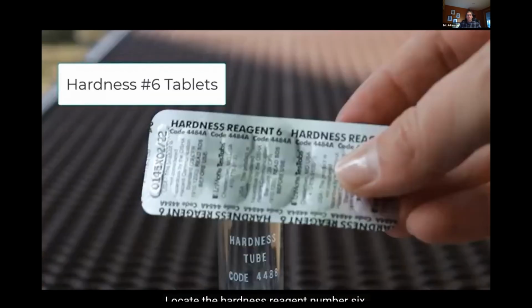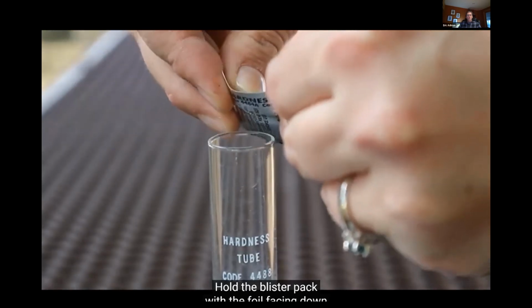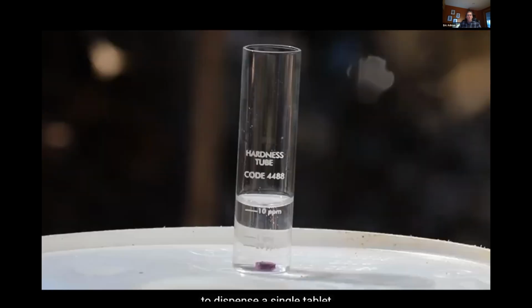Locate the hardness reagent number 6 tablet blister pack. This reagent is in tablet form and is very soluble. Take care not to touch the tablet or allow any water to come into contact with the tablet prior to dispensing it into the hardness tube. Hold the blister pack with the foil facing down over the opening of the tube. Press on the opposite side of the blister pack to dispense a single tablet into the water sample in the tube.